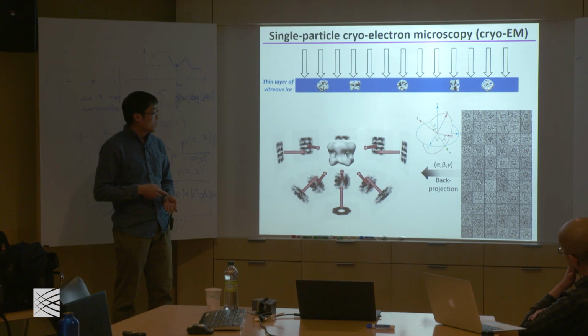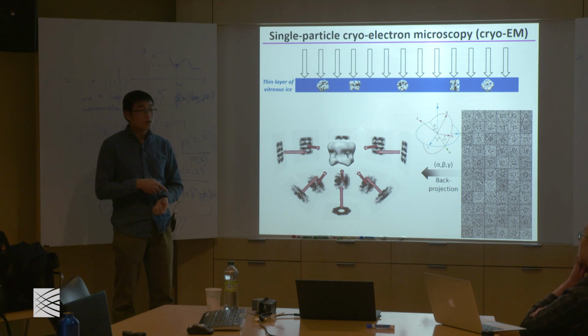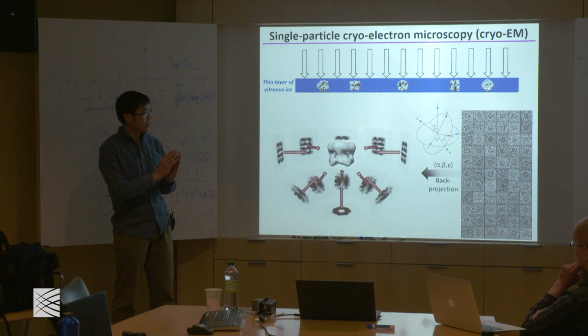If you are familiar with crystals, in a way you can think of this as crystallization in silico. Because you don't require a crystal to make the molecules ordered, you actually use computation to calculate their angles.